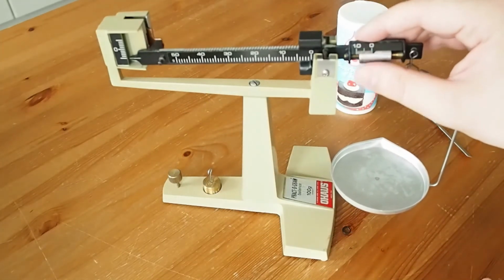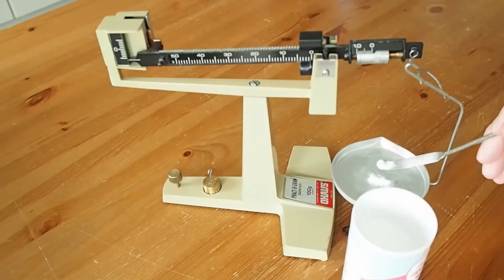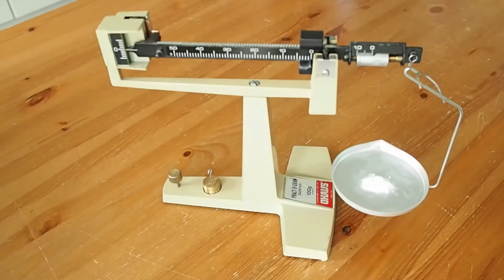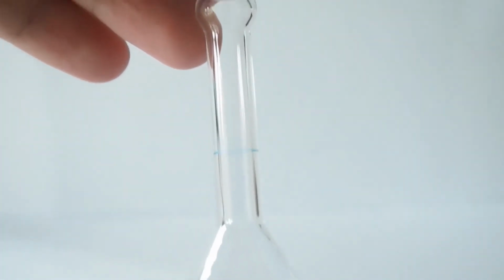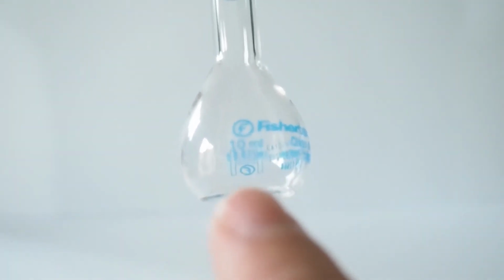We'll weigh it out very accurately with this balance. And you'll see when the dial gets to 0 that we know we're spot on there. Lovely. We'll put that into a beaker. And then we're going to make use of this volumetric flask, they're very accurate pieces of glassware. And this one's for 10 millilitres. So I'm going to use it twice for this.